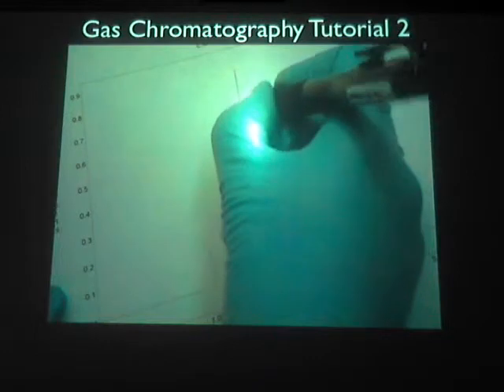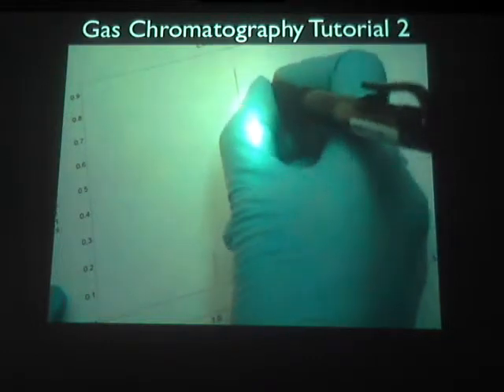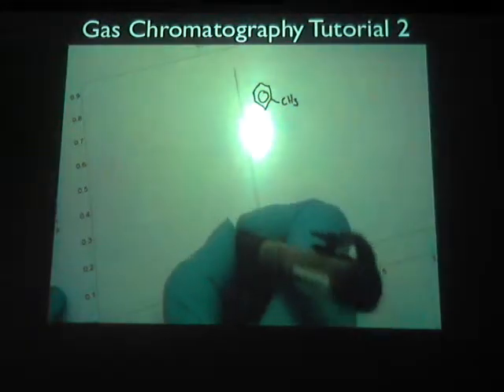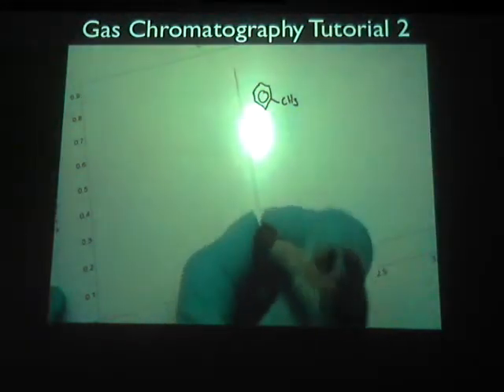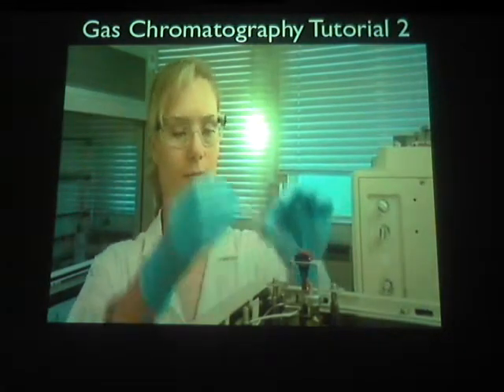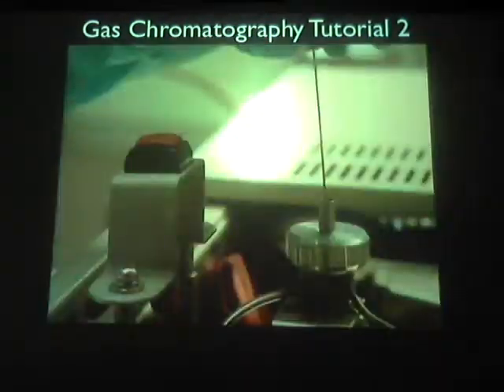The area under each peak is proportional to the amount of each component. See how she draws methylbenzene? The computer calculates this. Same as we would have. This instrument is used for undergraduate practical sessions, and samples are run singly as and when each student is ready.